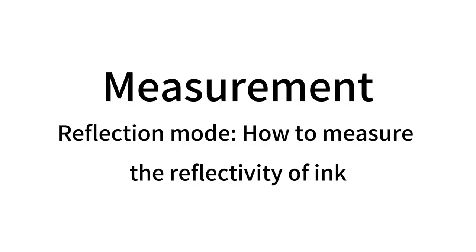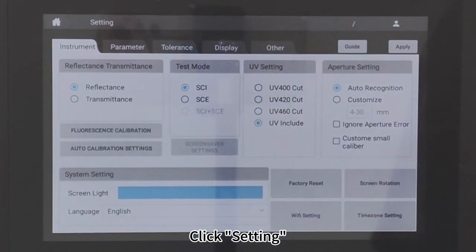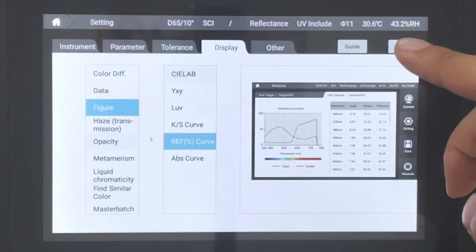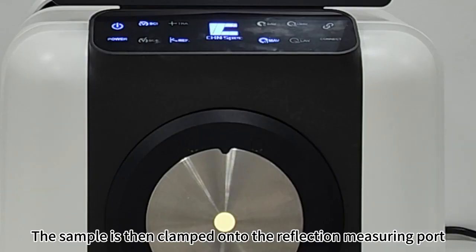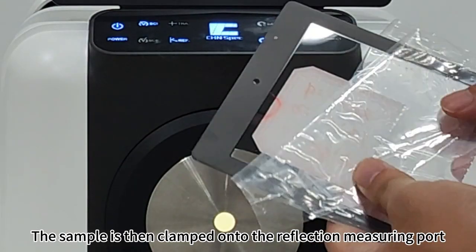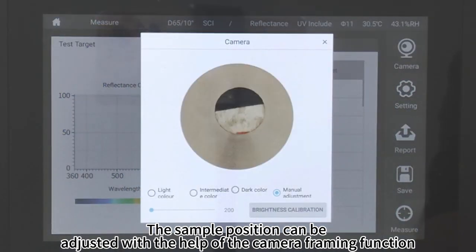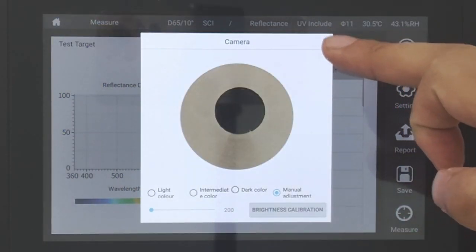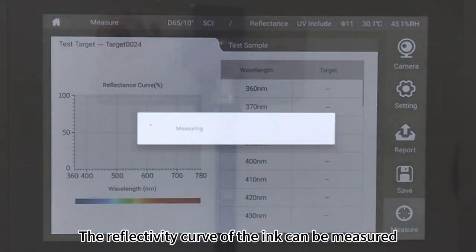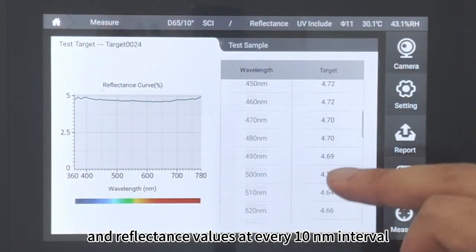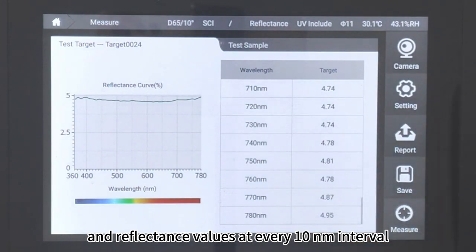Reflection Mode. How to measure the reflectivity of ink: Click Setting, click Display Figure, Reflectance Curve, Apply. The sample is then clamped onto the reflection measuring port. The sample position can be adjusted with the camera framing function. Click Measure. The reflectivity curve of the ink can be measured along with reflectance values at every nanometer interval.